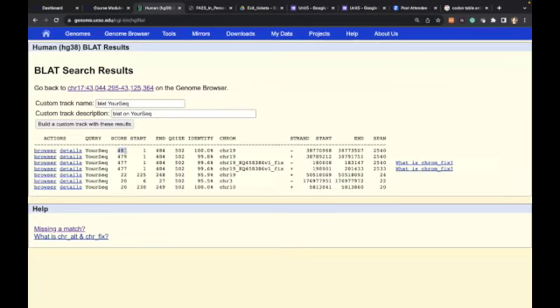The highest score one is the 481. Higher, your first sequence, to the 484. The query size is 502 bases. So the last 18 bases has some problem in aligning. And then it aligned to chromosome 19 minus strand from here to here, spanning this much bases.